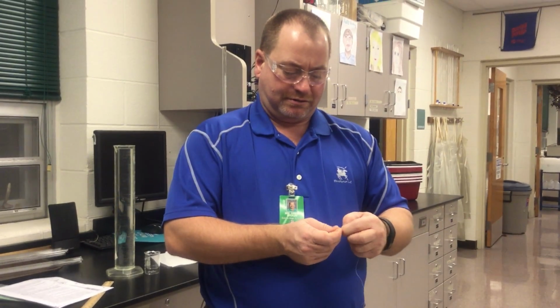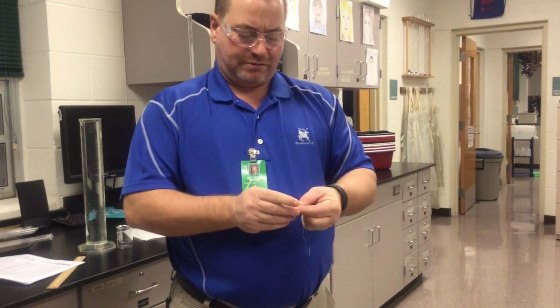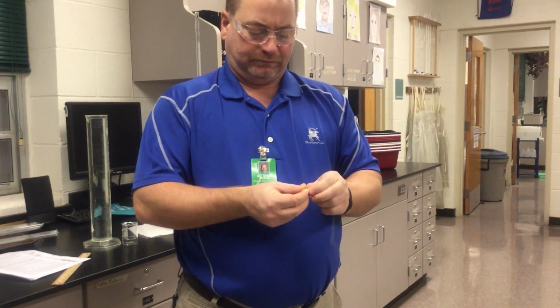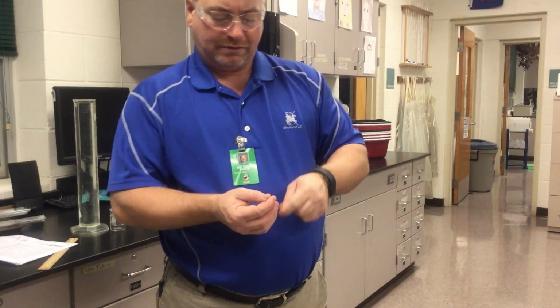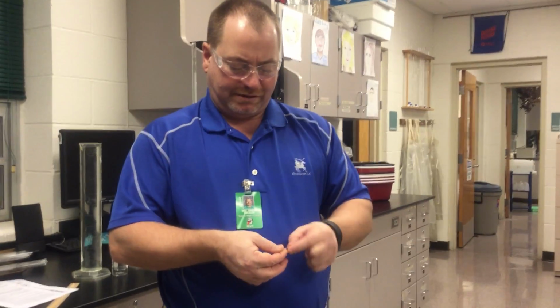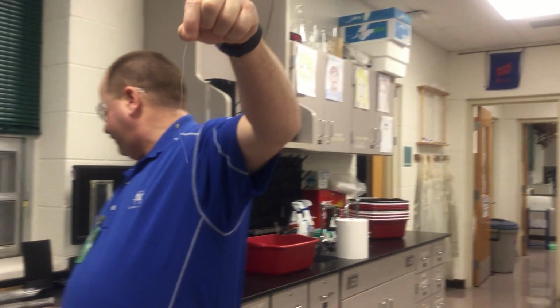Get in there. Just going to make a little double knot here, hopefully. Okay, so I've got my magnesium tied on to the end of the thread.